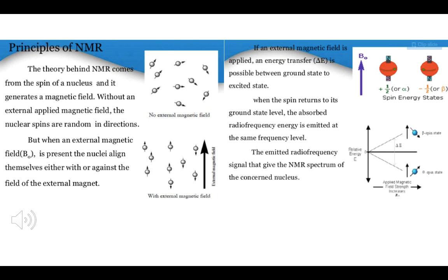So there are 4 types of information that you get from NMR spectra. One you get is the total number of signals. The different numbers of signals describe how many different types of hydrogen, whether we have a CH3, a CH2, a CH, or an OH. Second type of information, chemical shift. It's usually the x-axis, and it describes how shielded or deshielded hydrogens are.